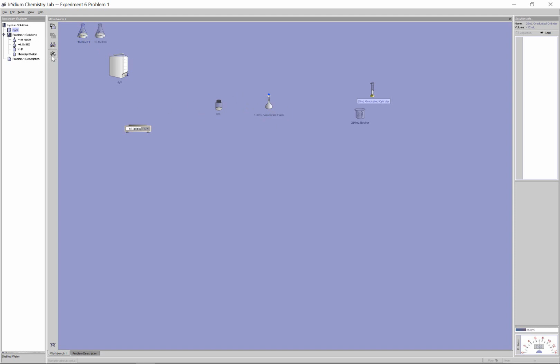So for titration here, the other type of glassware that we need here is a burette. The burettes here, they do come in many shapes and sizes, but in our case here, we have a 50 ml burette. What I'm going to do is I'm going to put the base in the burette. Remember, the 0 mark is at the top, the 50 mils are at the bottom.